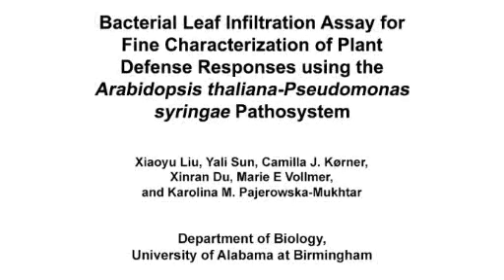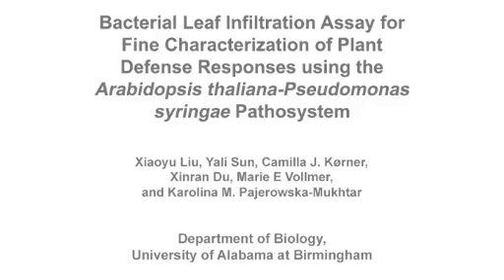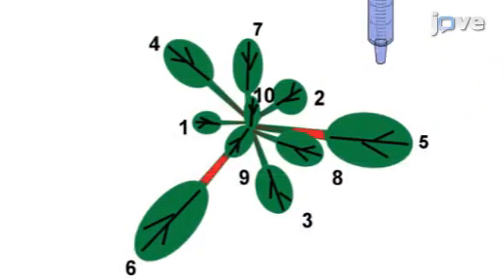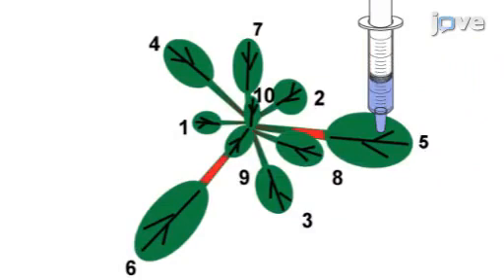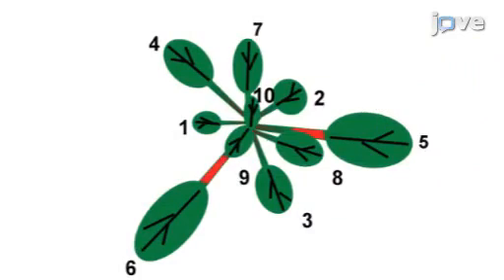The overall goal of this procedure is to quantitatively characterize Arabidopsis thaliana immune response through an optimized syringe infiltration assay. This is accomplished by first using syringe infiltration to manually deliver bacteria into the leaf through the natural openings called stomata.